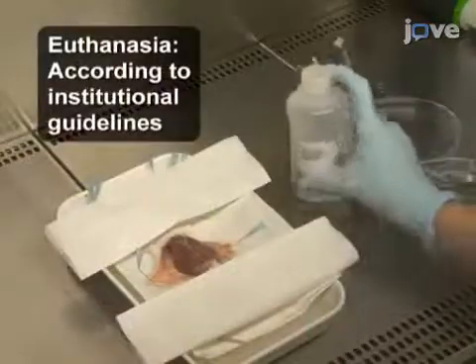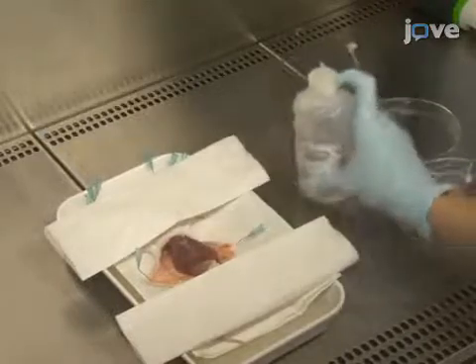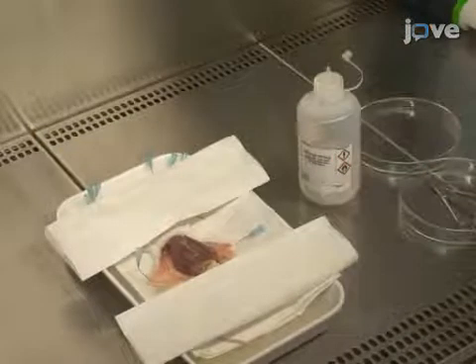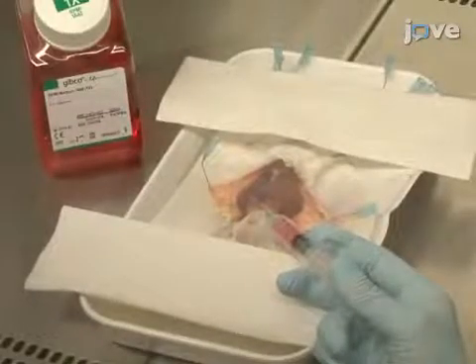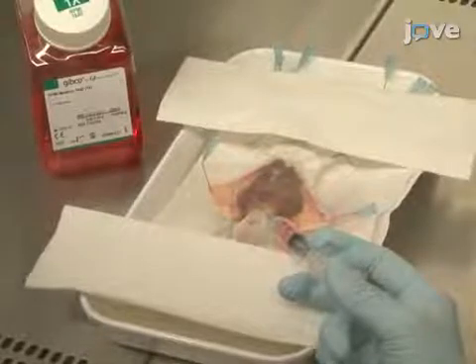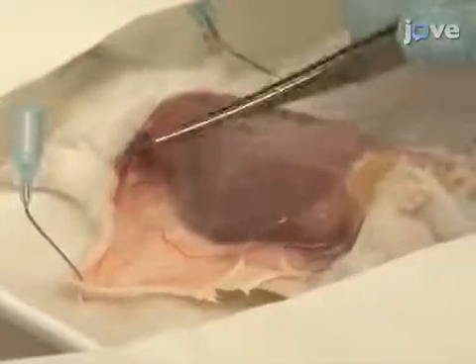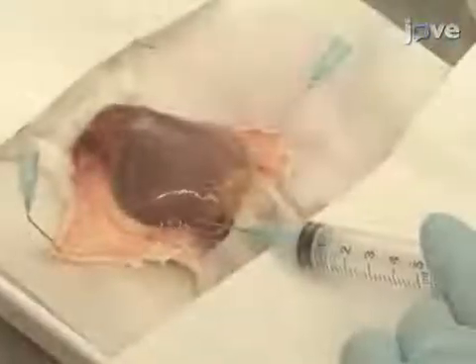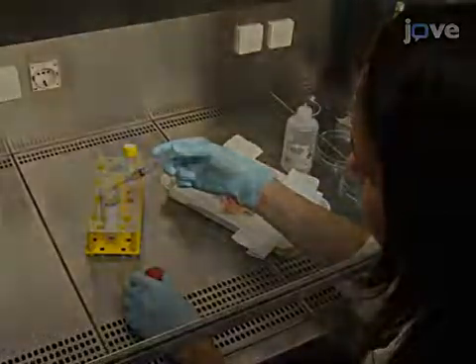To prepare feeder cells, remove the fur from a 12-week-old NMRI mouse and disinfect the abdomen with 70% ethanol. Next, inject 5 milliliters of ice-cold RPMI medium into the abdominal cavity and use tweezers to massage the abdomen. Then withdraw the feeder cell suspension and dispense the cells into a new 50 milliliter tube.